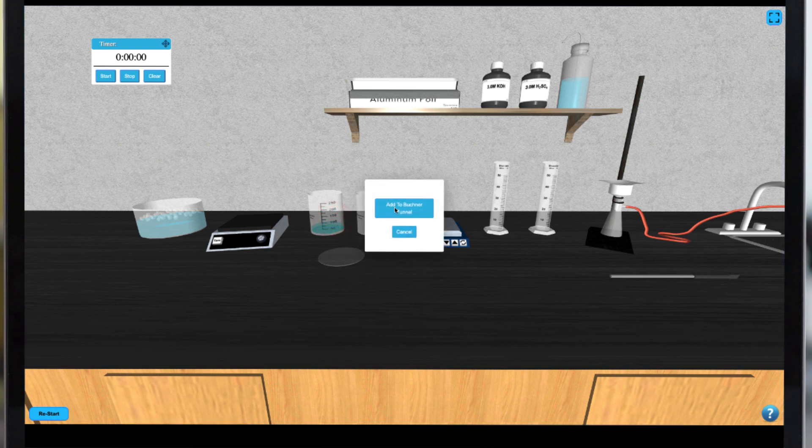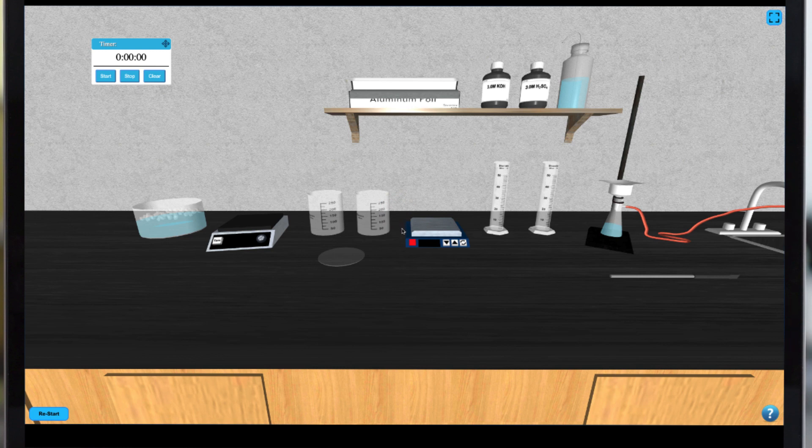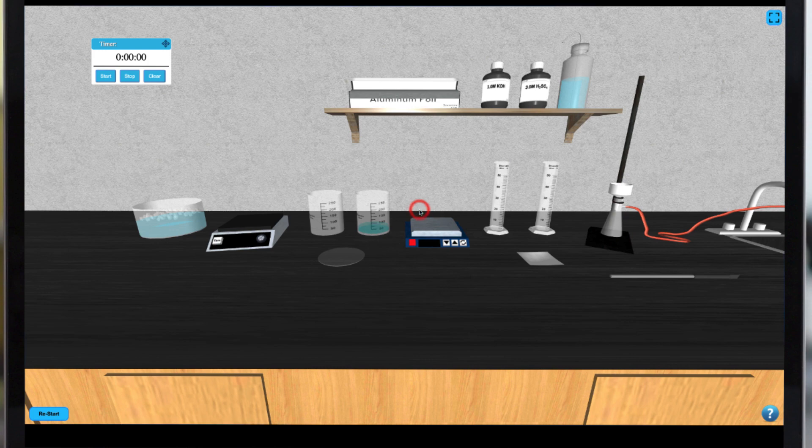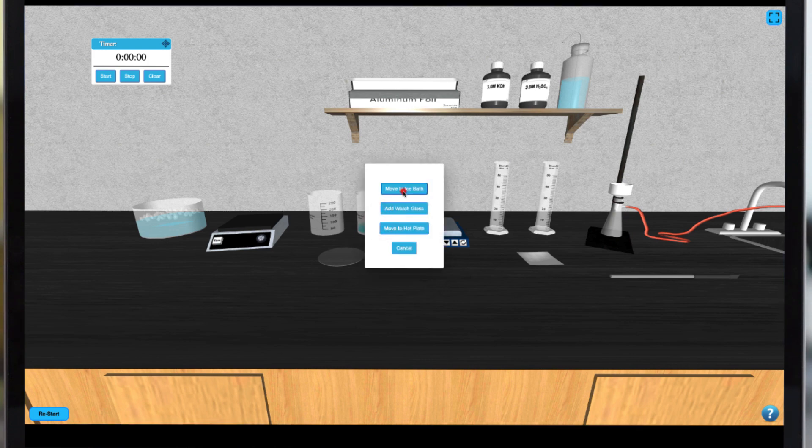Once your sample has been filtered you can transfer the filtrate to a clean beaker by clicking on the filtrate. Then move the beaker to an ice bath to cool for one minute.